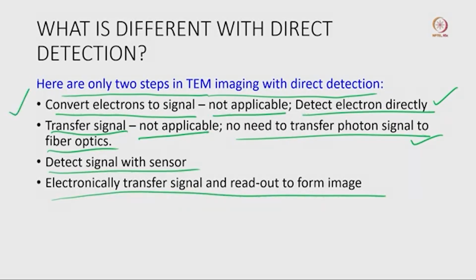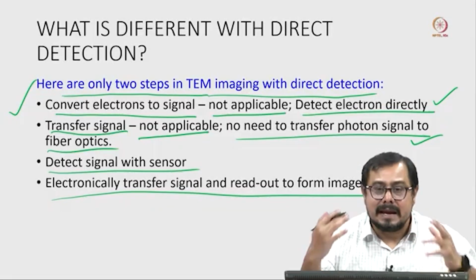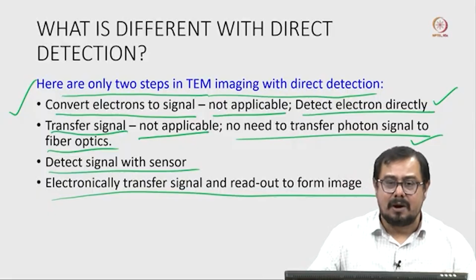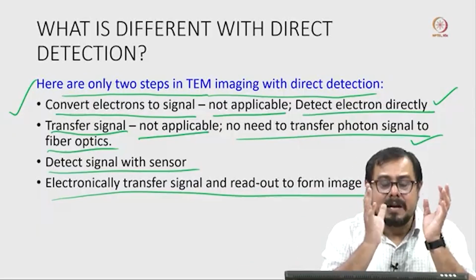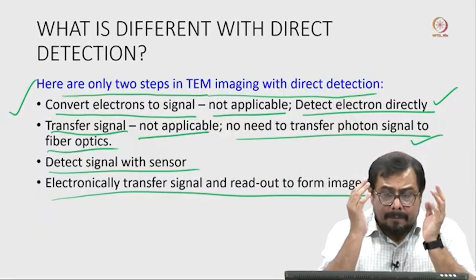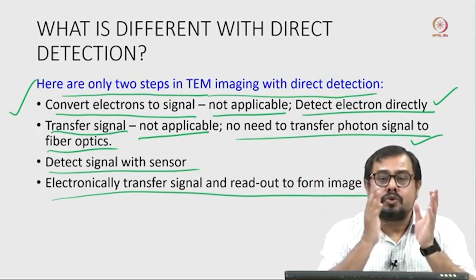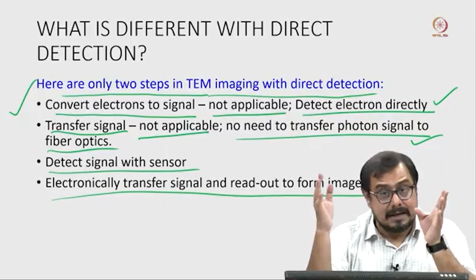So, these are the 4 important points that help us get fast readout and very good quality, high resolution images. Because of this fast readout, we can also correct the drift, and it preserves most of the high frequency signal. When we preserve high frequency signal, that helps to get a high resolution structure. Those high frequency and low frequency signals we are going to discuss in the next class.